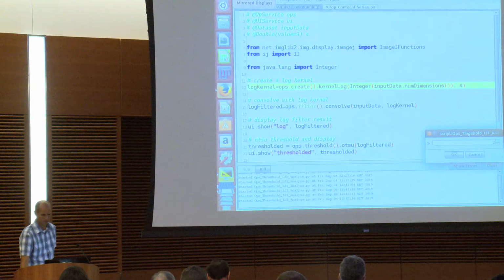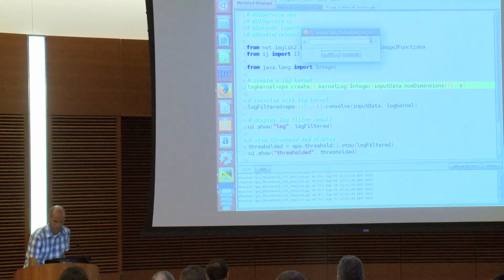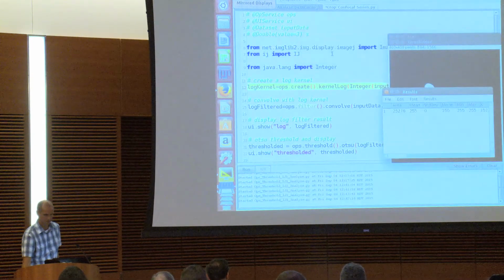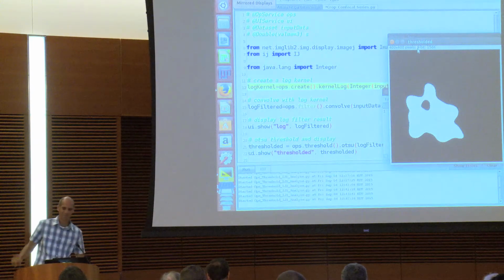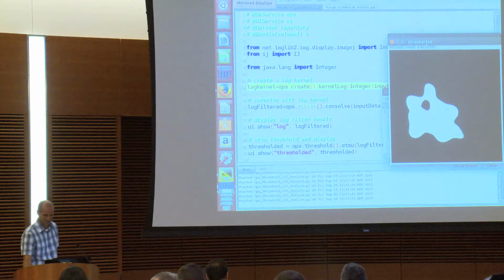Oh, so we have our thing. We have our S, and I'll make our S super big. He ran it before, and it remembered the two. Oh yeah, it remembered the two. If you don't want that, you say persist equals false in the params, and then it would always start at 3.